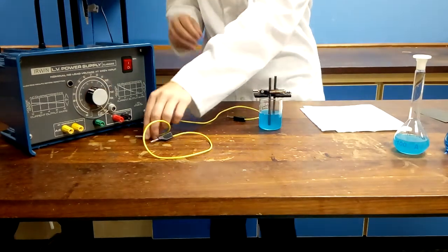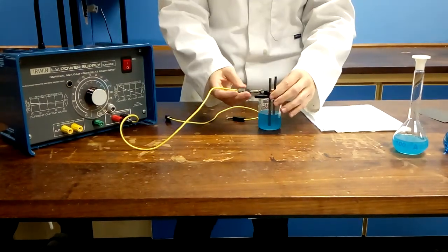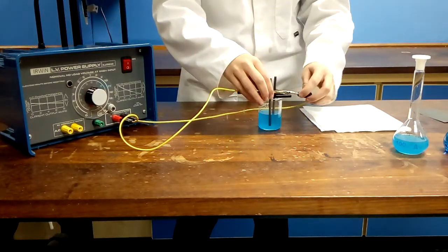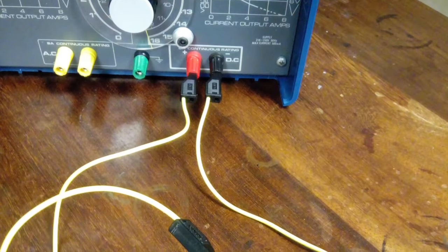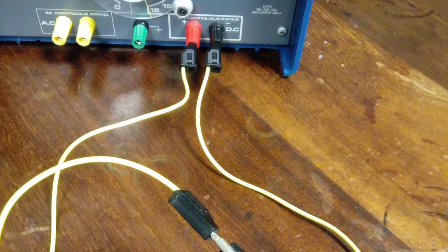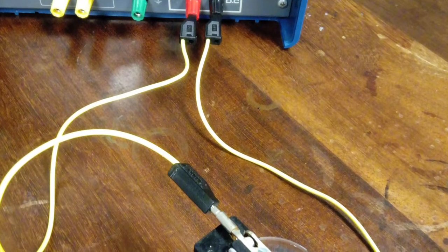Next, you need to connect the electrodes to the power supply with the crocodile leads provided. The DC terminals are used. That's the red and the black coloured plug-ins on the power pack. The carbon electrode connected to the black terminal is the cathode. It is supplied with electrons and so is negatively charged.